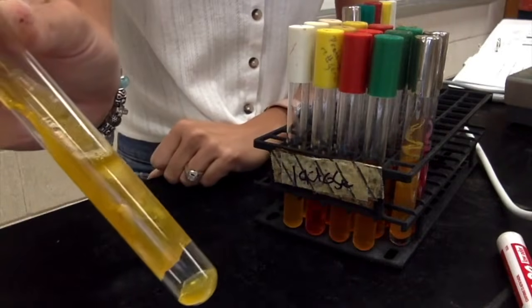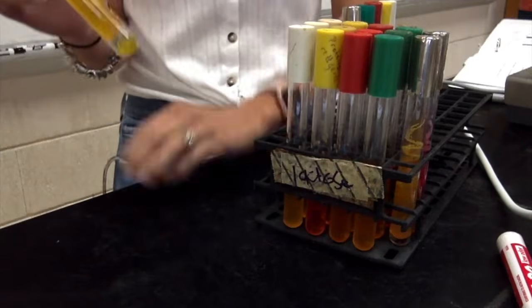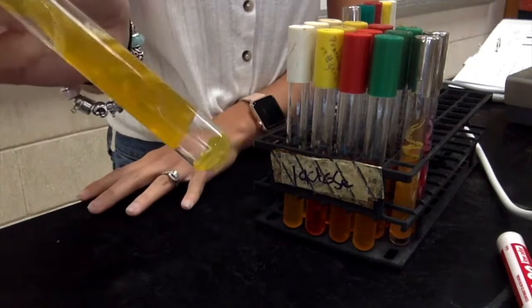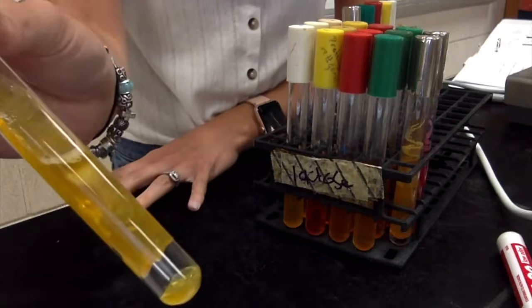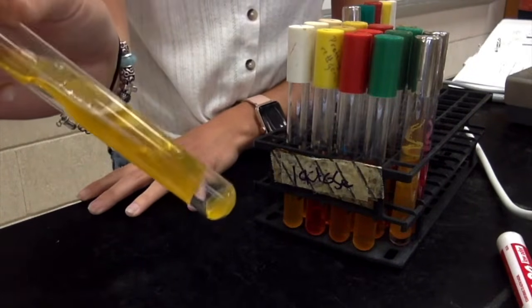It's all yellow. So for my E. coli, my result would be A over A, an all yellow tube. So E. coli fermented these sugars in the TSI. Now we don't know which ones. We've got to break it up and see which ones, but it fermented something in there.